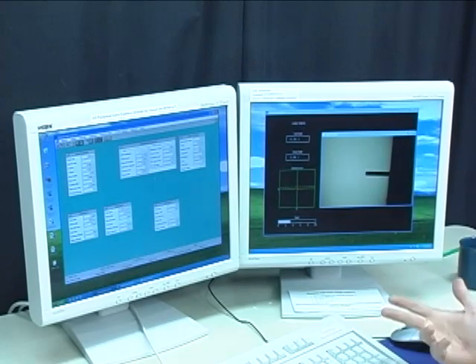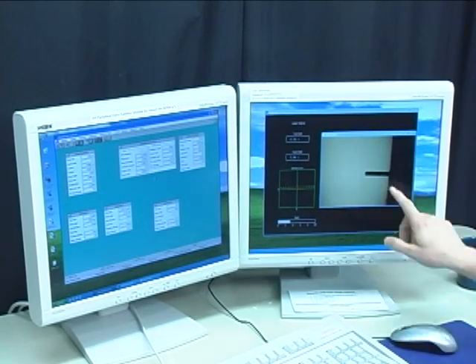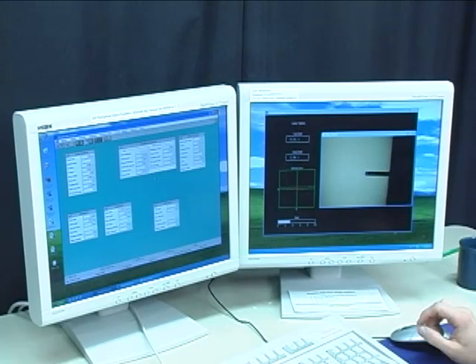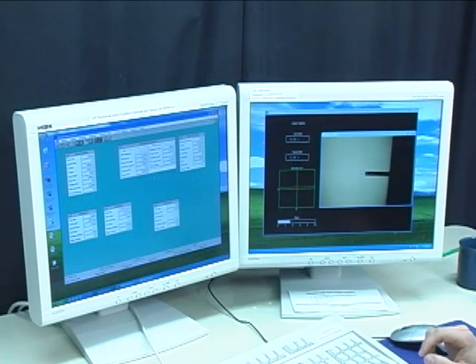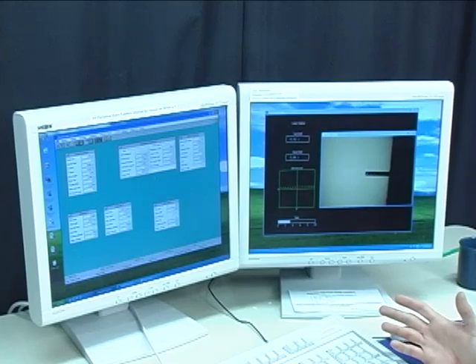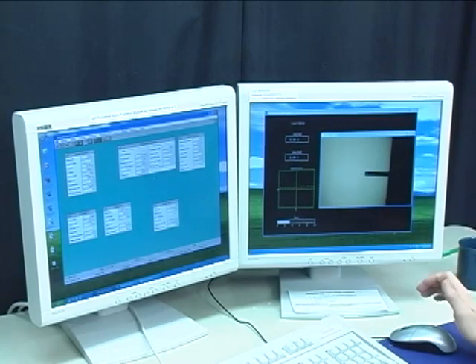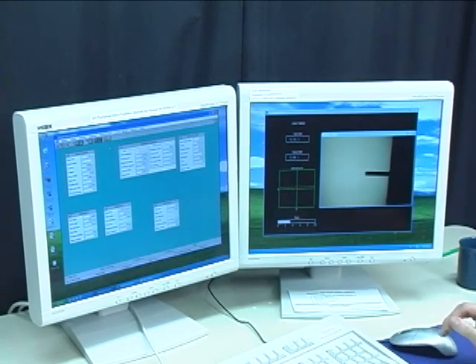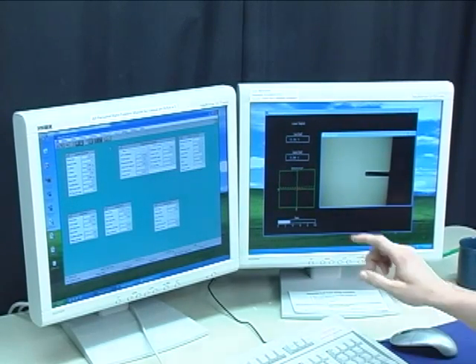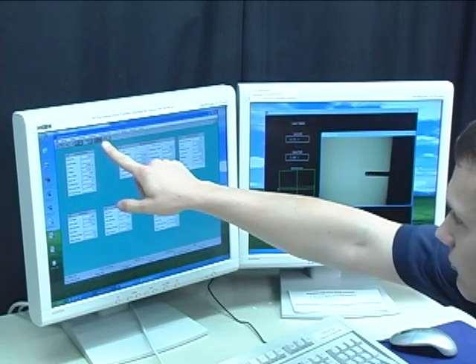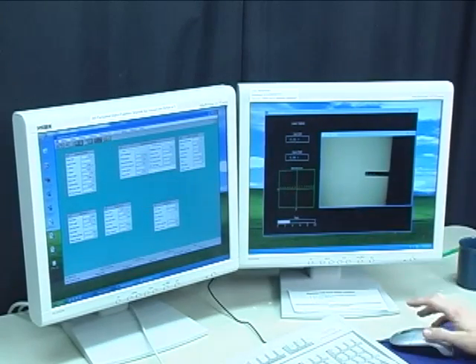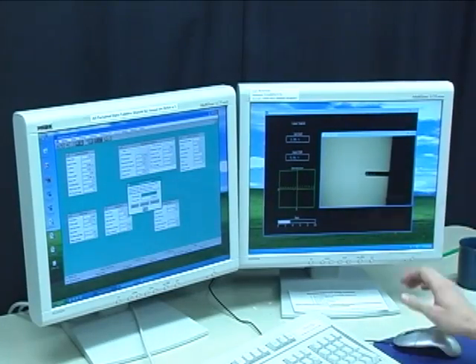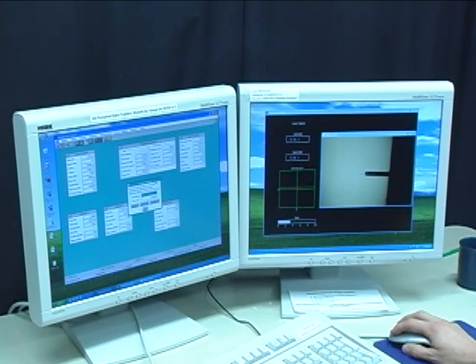So having focused the microscope on the AFM tip, we're now going to focus the microscope on the actual surface of our sample. And this is how the microscope actually aligns the tip very near to the surface without actually ramming into it by accident. So we'll start off by clicking on the focus surface icon.